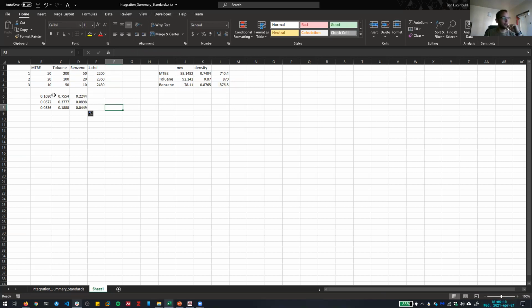in the stock solution. Remember, for our actual samples that we run, we do a further dilution by taking 20 microliters of one of these solutions, then diluting it with 1 mL of the chlorohexadecane plus 50 microliters of the D8 toluene standard, right? So why don't we go through now and calculate those final concentrations so that we can make an example calibration plot for one of these chemicals and show that it's working.